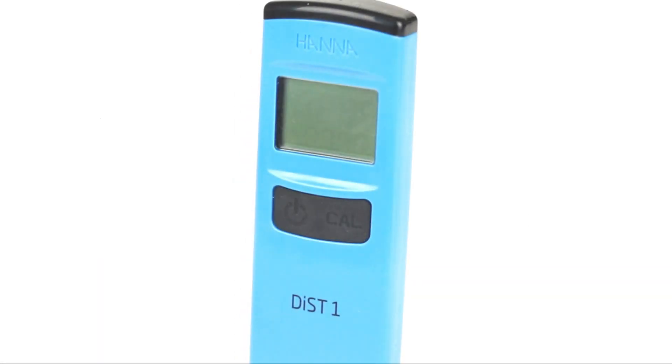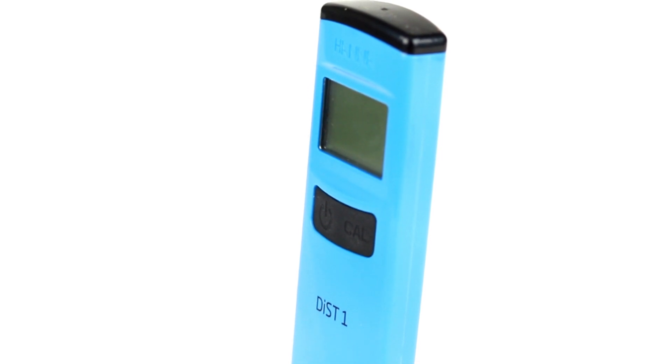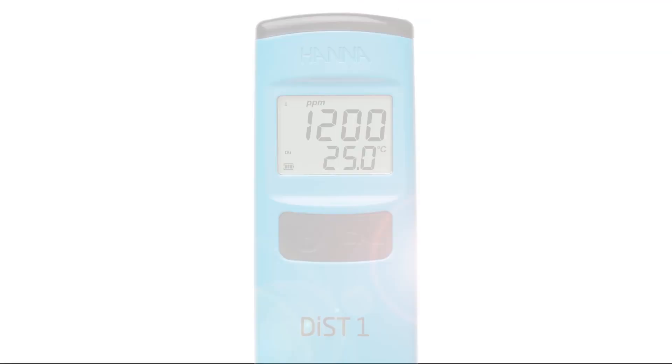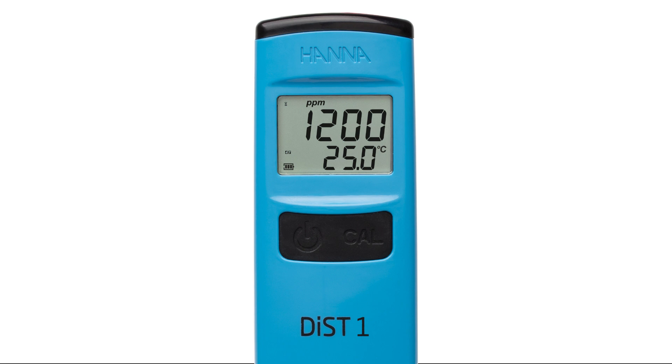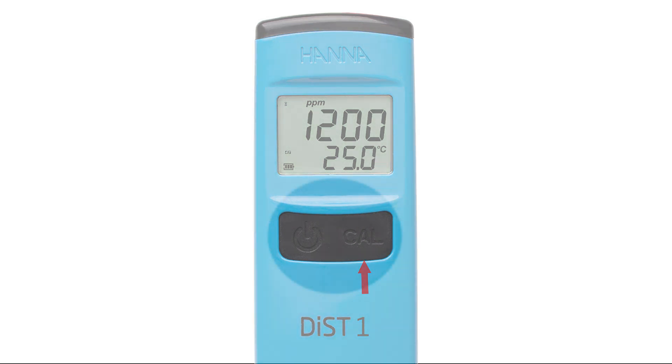The DIST meters are designed with accuracy and simplicity in mind, starting with a slim ergonomic design that fits comfortably in your hand, and a high contrast, large display that is easy to read. The daily operation of the meter has been simplified to just two buttons — one for turning the meter on and off, and the other used to enter calibration mode.